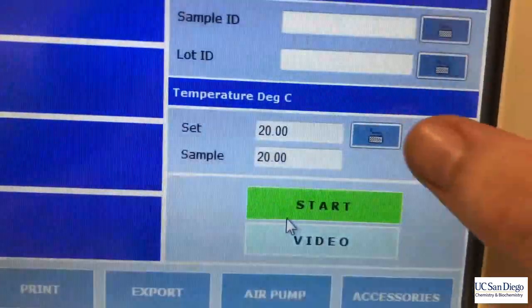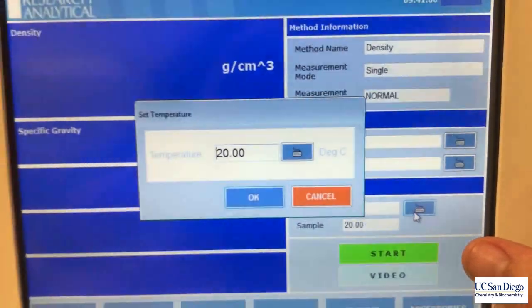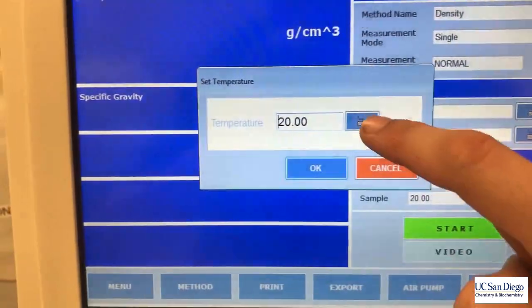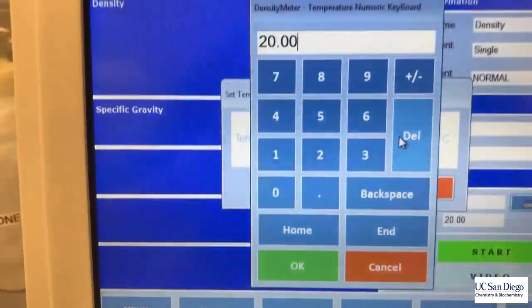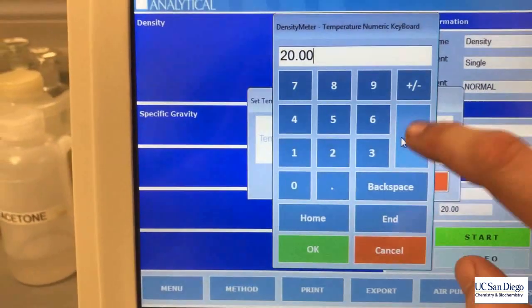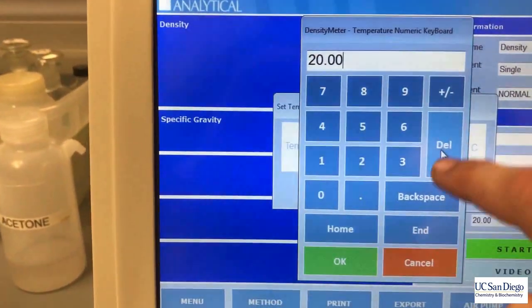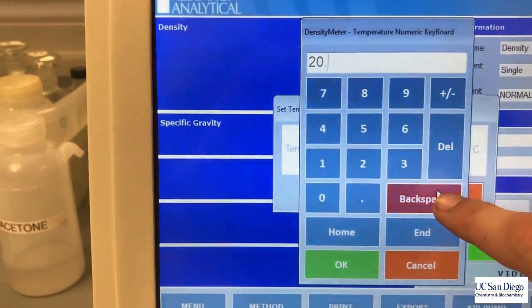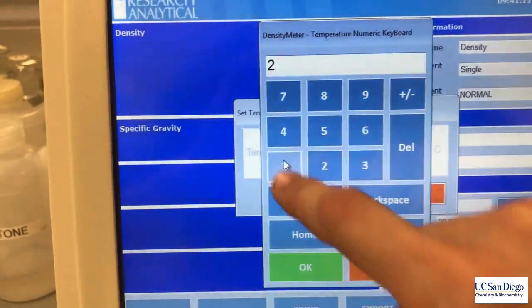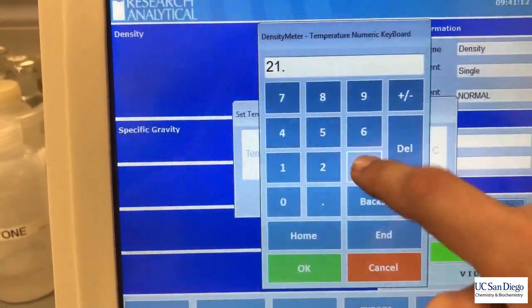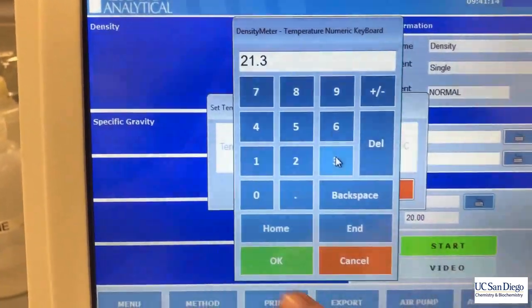Once you're satisfied, scan the length of the U-tube to look for any bubbles. You'll want to set the temperature of the U-tube to the temperature of the sea water sample that you measured in your BOD experiment. In this case I chose 21.3 degrees Celsius.